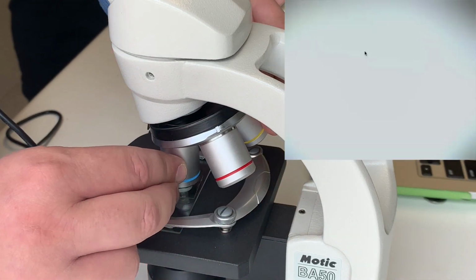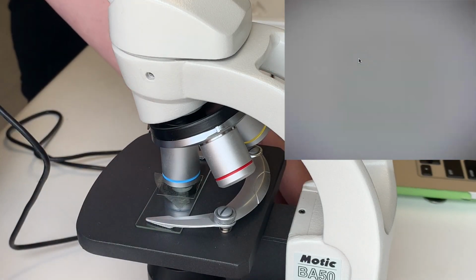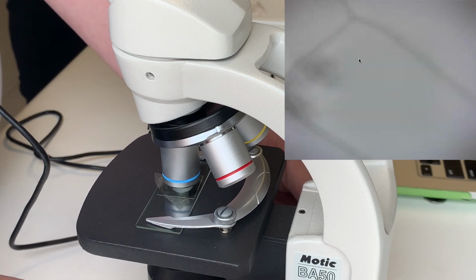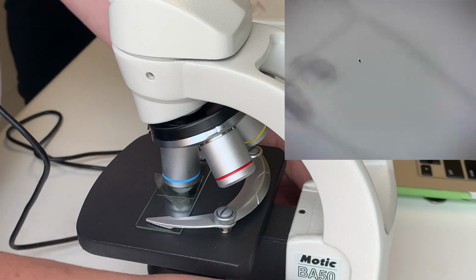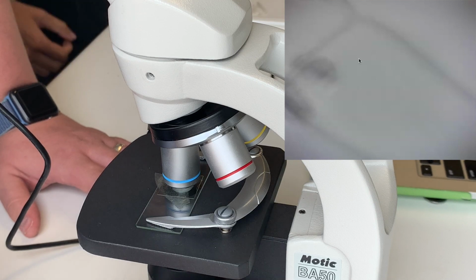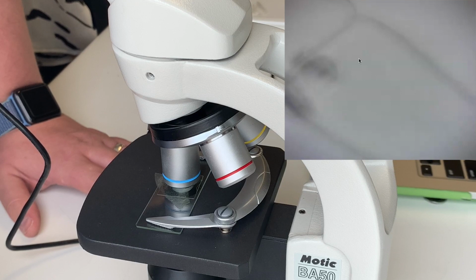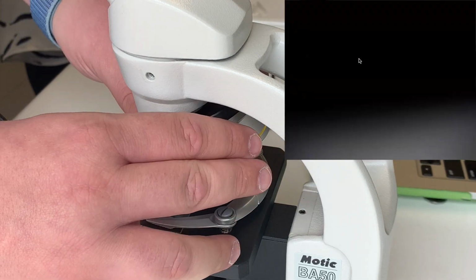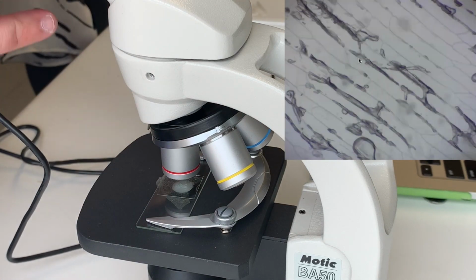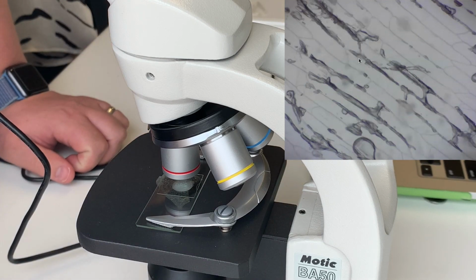Final magnification, we're now moving up to 40 times magnification, 10 times up here, 400 times magnification total. And again, start at the top, move the stage down until you get it in focus, and then you need to fine focus it a little bit. And that's probably the best magnification we're going to get at 400 times. But there you can see how to use the microscope to view an image of an onion cell. We'll go back to the 4 times magnification and 10 times up here, so 40 times magnification total. And Miss Hogben will take you through on her iPad how to draw this.